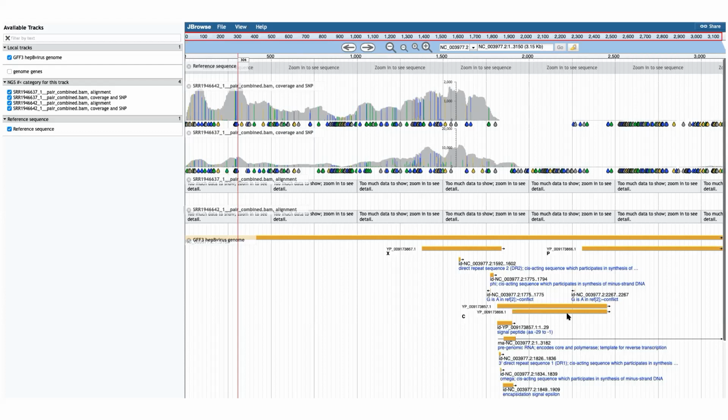So how do we know that the virus is there? The virus is there if reads map onto a significant portion of the genome. How do we know that this is present and replicating? The more this is covered, the more the coverage, and the more genes are being covered, the higher confidence we have that this is actually happening.